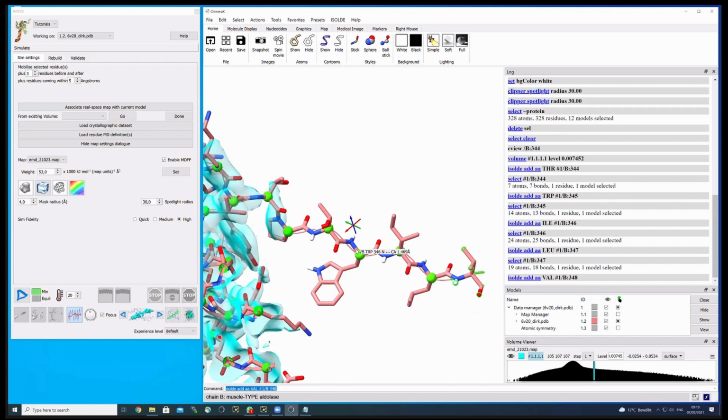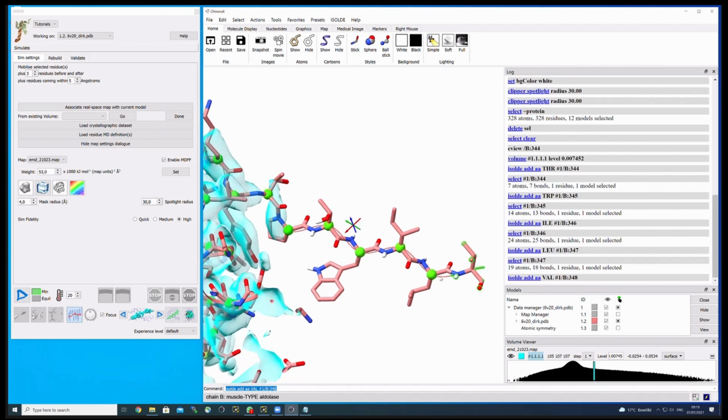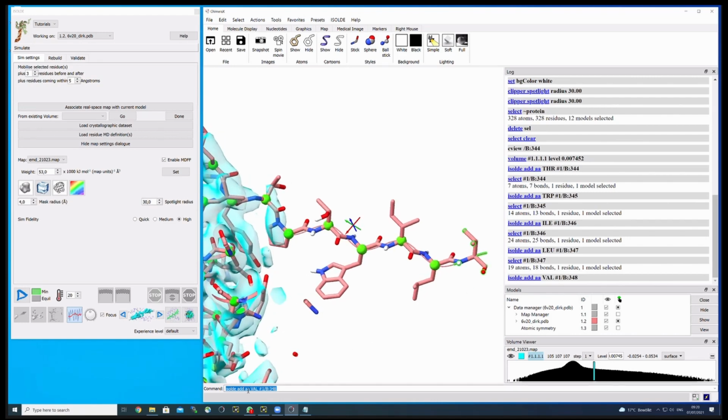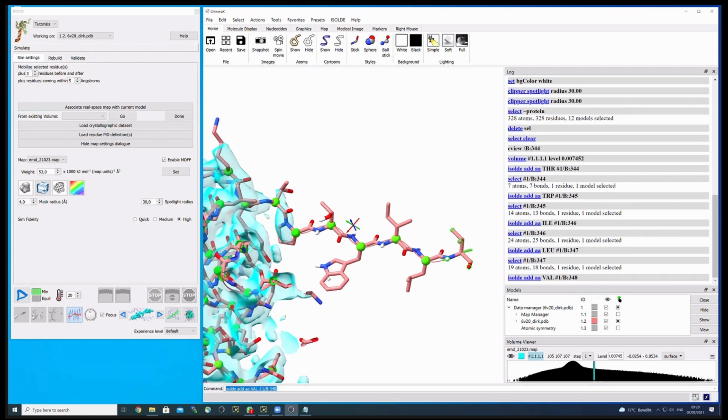So now basically by just copy pasting this script, which of course is handwritten, and one needs to adapt this to the sequence that you actually want to build, obviously, you can add a number of residues at once, which makes the model building process much faster. Previously it was a bit more work because the command wasn't implemented and wasn't so easy, but this is now very convenient.